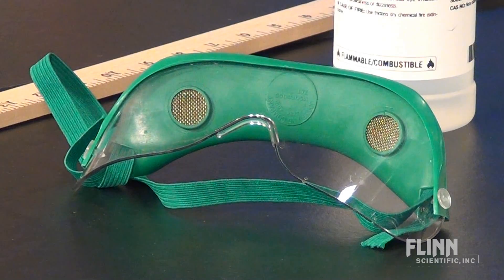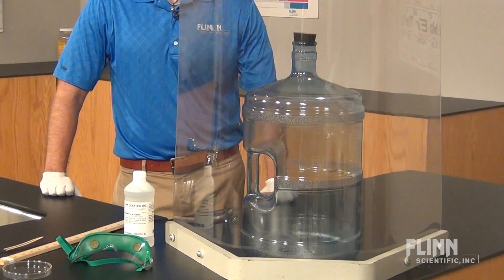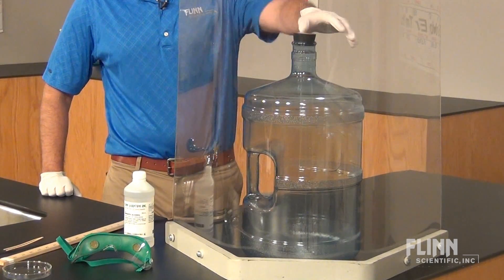Proper personal protective equipment such as safety goggles must be worn by everyone. A safety shield is recommended for combustion demonstrations in the classroom.